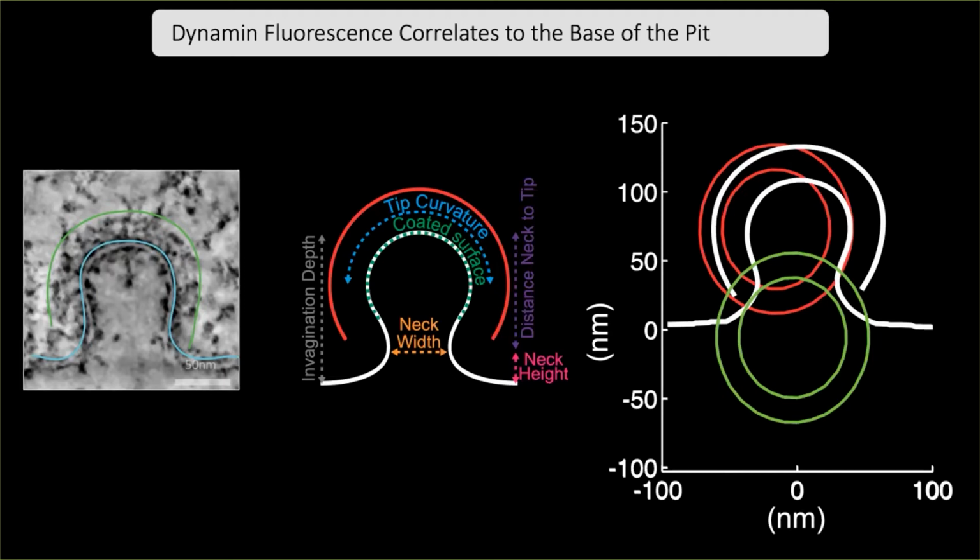However, I would also mention that it's quite rare for us to find scenarios in which you really need that high correlation precision. This is unique when your object is firstly not symmetric, like an invaginating segment on the membrane, and also that it's of the right dimensions.